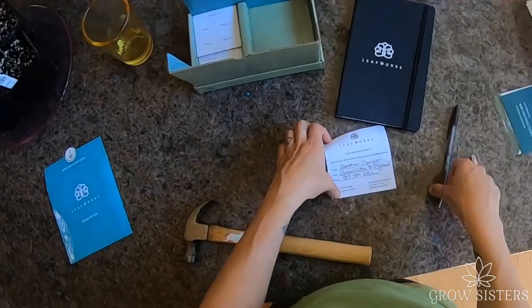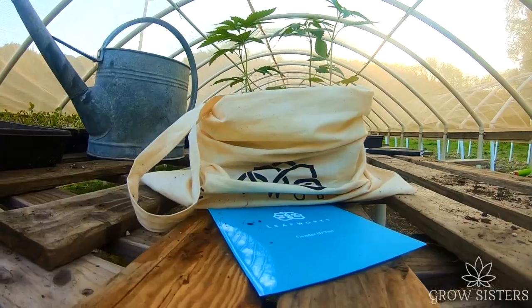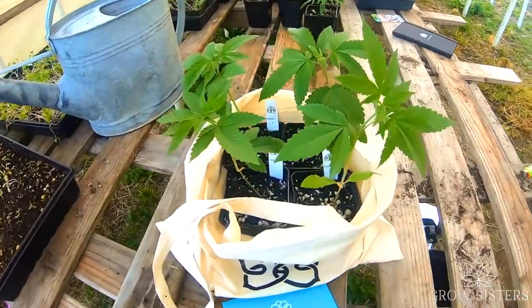Fill out the return card and include your name and email, because LeafWorks will be emailing you the results. Place your kit in the mail and you're ready to go.